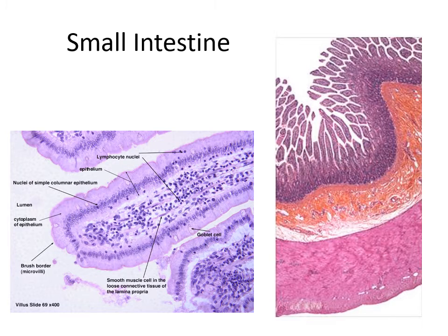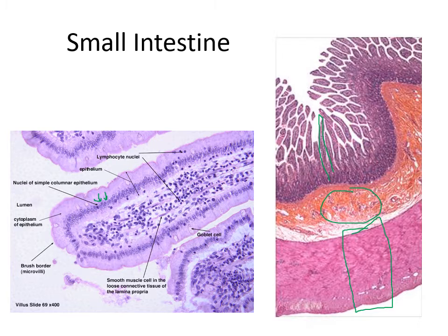Here are another couple of images. This one on the right simply used a different stain, that's why we're seeing different colors. Here's your muscularis externa, submucosa, mucosa with your villi. And on the left we have a close-up of a villus. Each one of these little tiny circles are individual nuclei of simple columnar epithelial cells. You can see these clear circles of goblet cells which are producing mucus. And on the inside of the villus — that area in there — is where we're going to find the capillary and the lacteal.